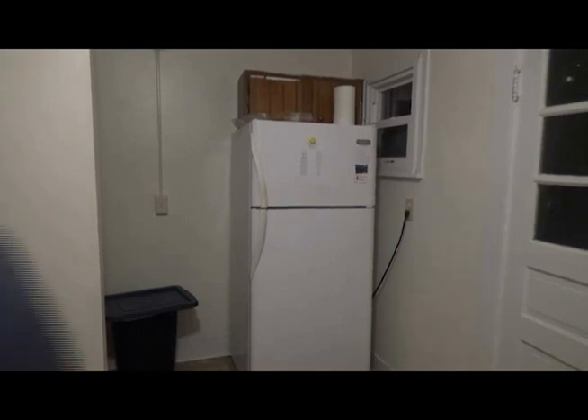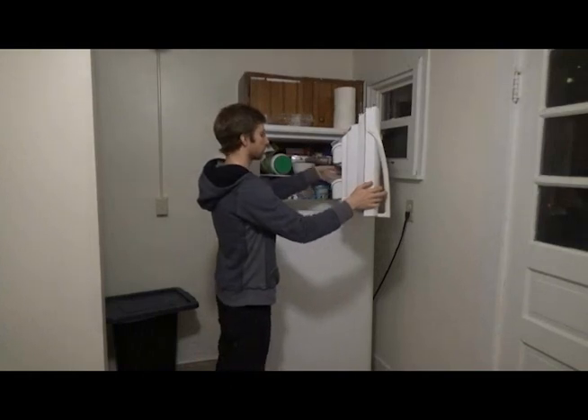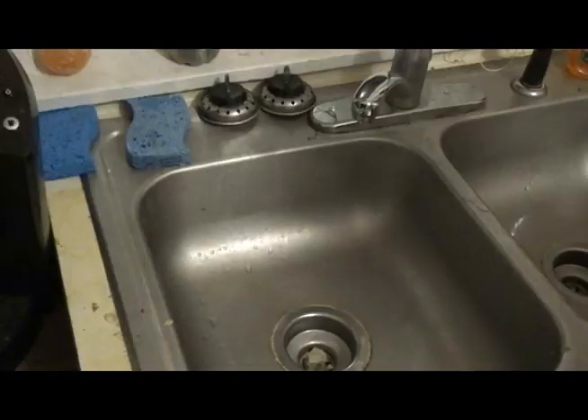A few months ago I caught some moths using a bucket trap and put them in the freezer. I now have time to go through and spread them. The first thing I need to do is relax them.